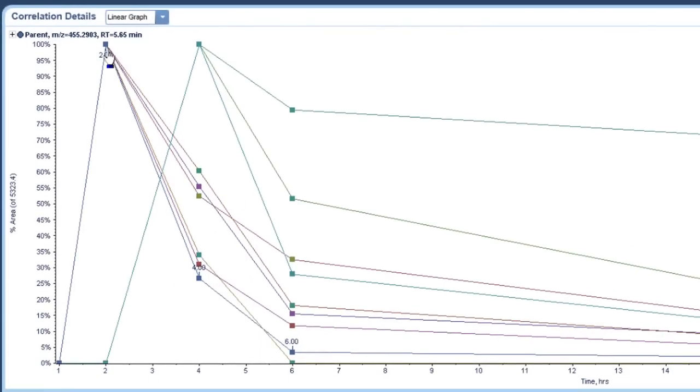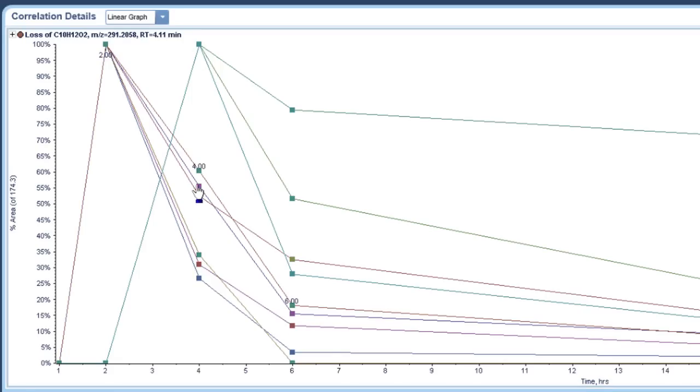So now we can see that some metabolites peak at 2 hours and some metabolites peak at 4 hours. So some form a little sooner. So there's that dealkylation, norverapamil, bis demethylation, the parent. And these later ones are oxidation. That's a bis demethylation that took some bit longer to occur. That one's at 4.96. This one is 5.08 minutes. And then this one is an oxidation at 5.33 minutes.